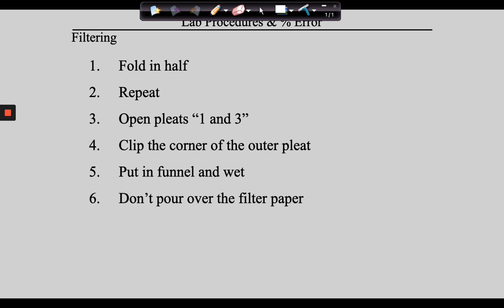By the way, guys, when you do this filtering, we have clamps on our ring stands that will hold the filter. What you're going to do is just open this up and then run the schnozzle of the filter into there, and that's how you're going to filter. You'll see. All right. So, guys, are we good with the skills? It's the schnozzle. That is a technical term. Two O's. Schnozzle. Yep. All right.